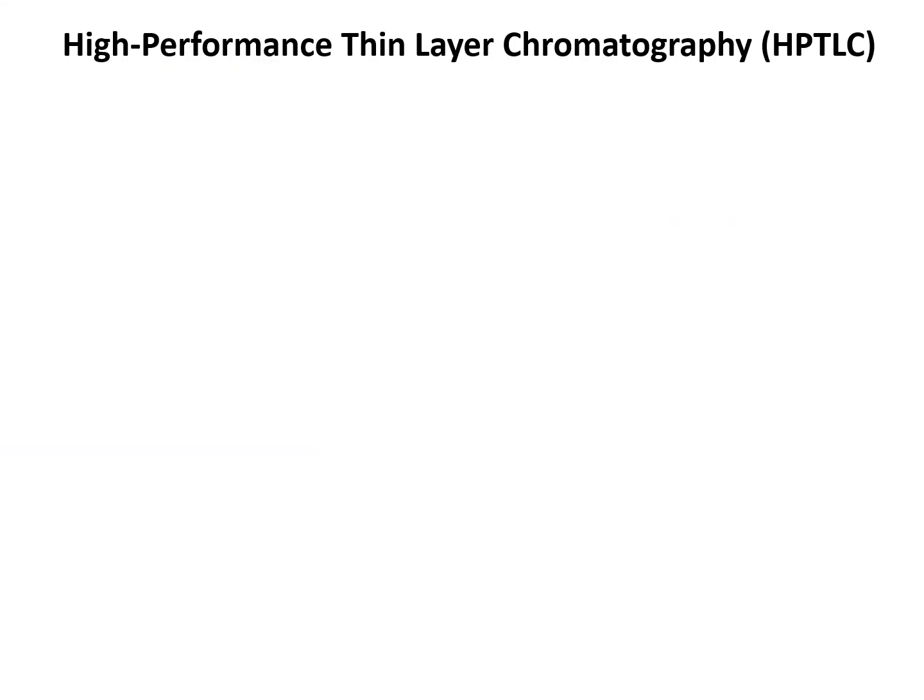Now, the second chromatographic technique in this presentation is high performance thin layer chromatography.